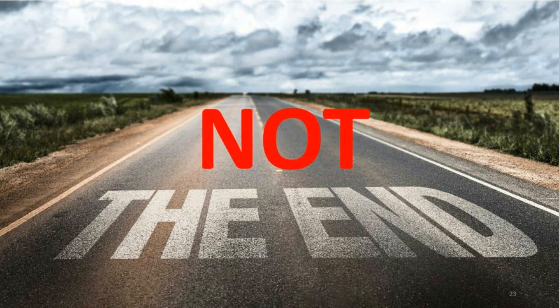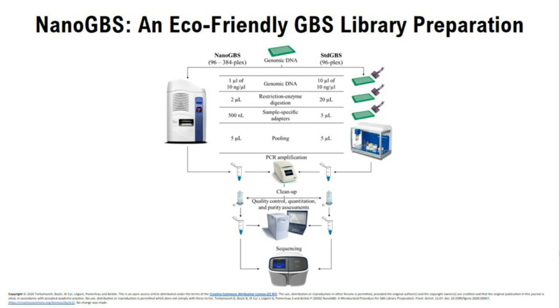If you remember the different steps of the library preparation for the GBS, in every step we were using manual pipetting with the pipette, and in each step we were using a high quantity of plastic tips. However, when we do the NanoGBS, we are not using any plastic tips for the transfer, as the technology is a tipless transfer. Why is this important?